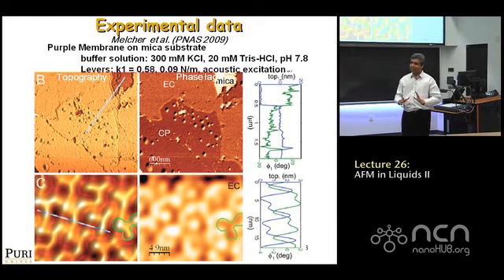Mica is more viscous than this biological sample, or something like that, which of course is not true. It is true the energy loss is greater, but the reasons for energy loss are not due to viscoelasticity, but rather you just get a lot more ringing transferring to internal degrees of freedom. That's where the apparent loss is coming from.